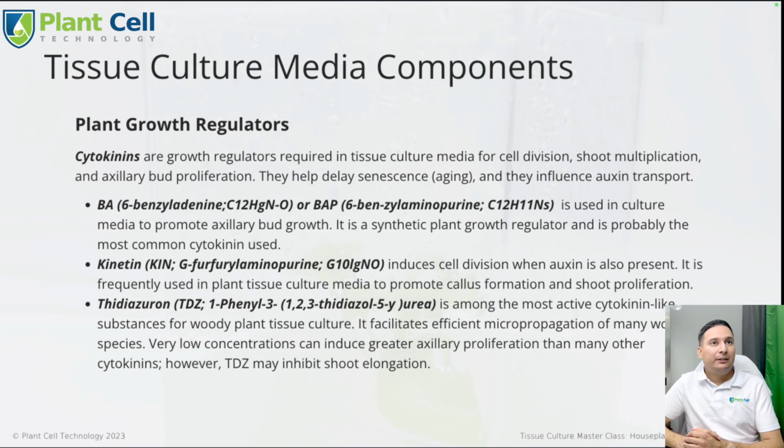Now, TDZ is one of the most active cytokinins. It's mostly used on woody plants, like rhododendrons or some trees. I have used it before for trees, or for bushes like blueberries and raspberries. TDZ is very effective. It is normally used in smaller quantities.